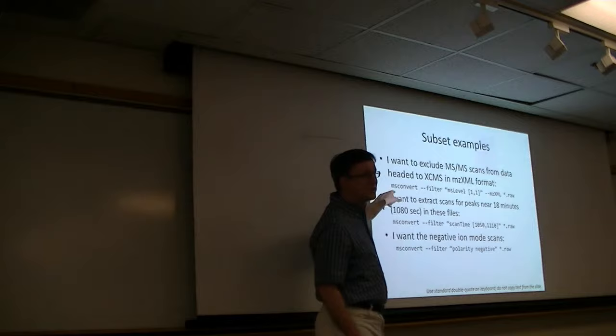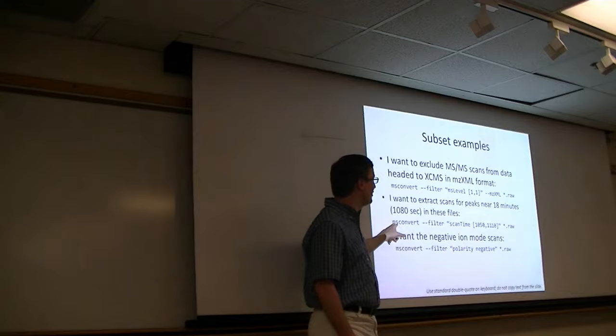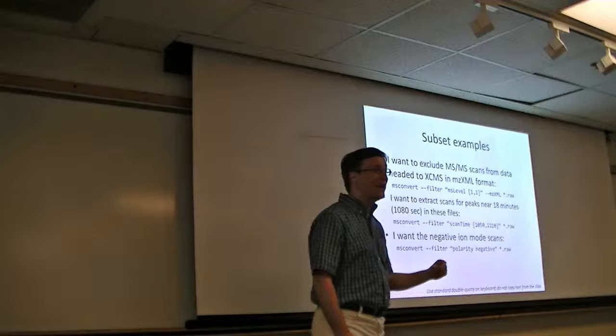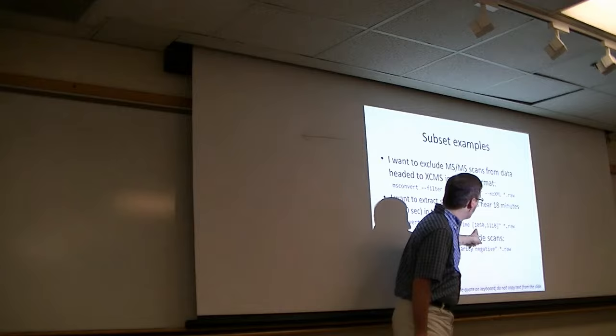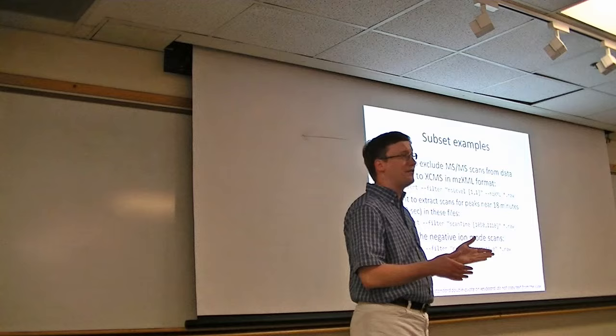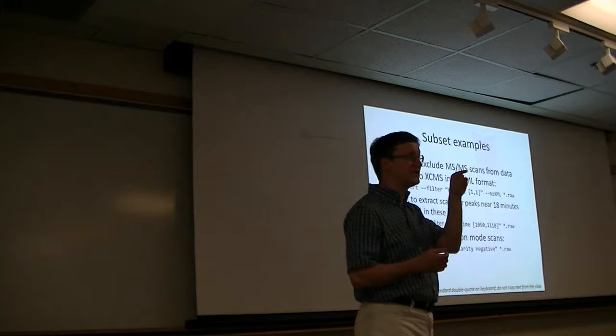Next, I want to extract scans for all those peaks that are near 18 minutes, which is about 1080 seconds in this set of files. So, we have some peak that's showing up around 18 minutes. We want to know what it is. So, this is how we go after those. We can run our MS convert with our scan time filter. Here, saying that anywhere between 1050 and 1110 seconds is okay. And, we're going to just process those raw files. So, this is going to kick out MZML files, one for each raw, that contain just that narrow range of scan times. Alright. If you want just the negative ion mode scans, the user interface is pretty straightforward on that. Just MS convert filter polarity negative raw. So, out pops an MZML file that contains just those polarities.